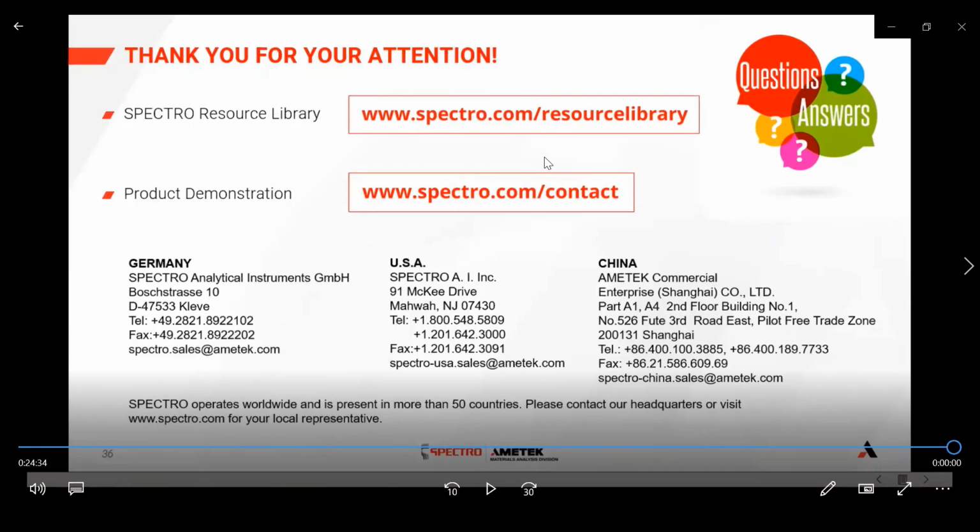And again, this is not a replacement for combustion. This is a supplement. It reduces the usage, but it's still critical for melt monitoring to have your own regular schedule for that kind of testing. But it does save you time and consumables.